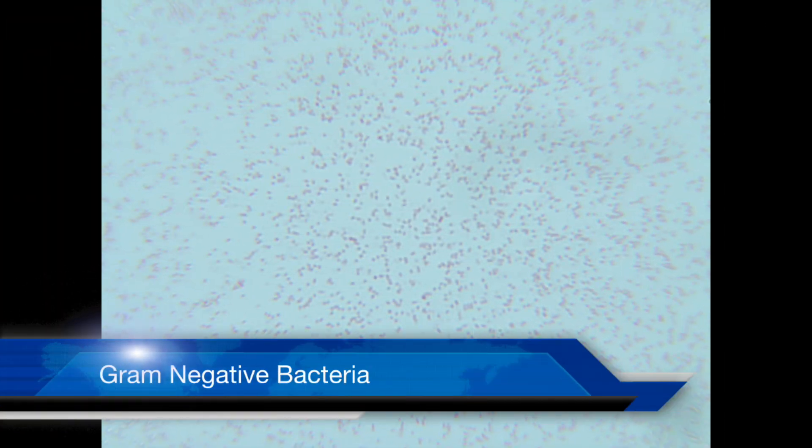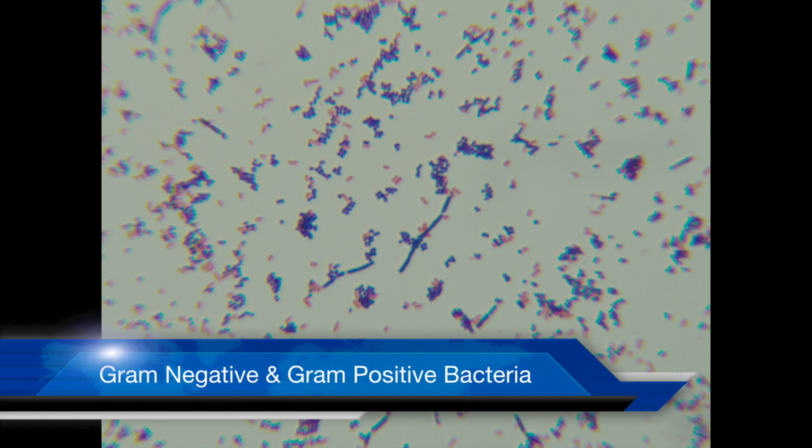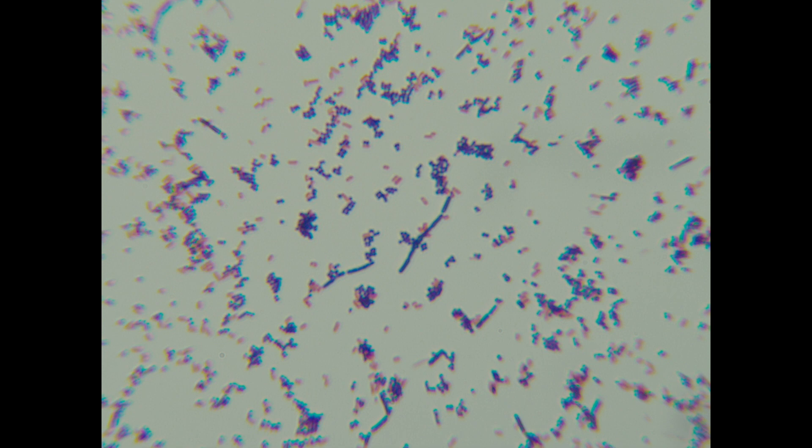Here is an example of Gram-negative bacteria stained. Notice the pink color. This is an example of a mixed culture showing both Gram-negative and Gram-positive bacteria. Note the differences in cell shape, size, and color.